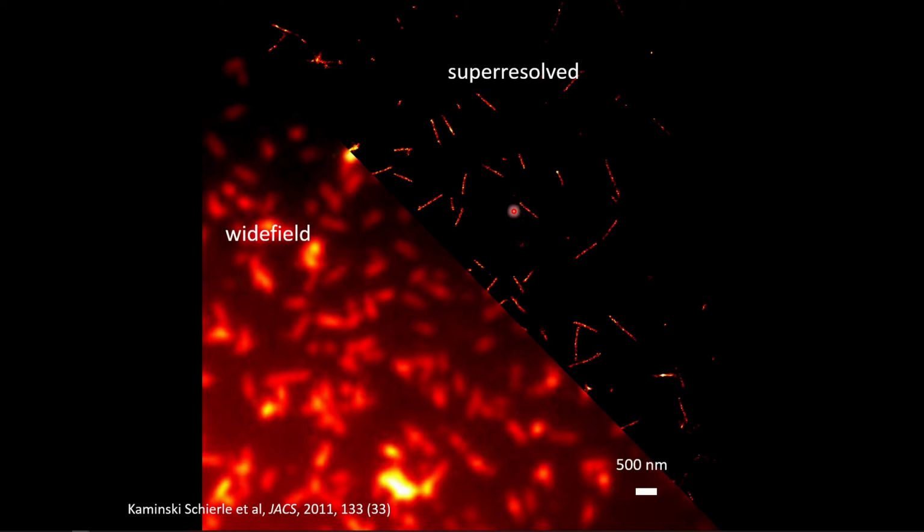What you see here is an image with a high numerical aperture lens, a fluorescence image of a protein called A-beta, and this protein forms fibrils in the brains of patients who suffer from Alzheimer's disease. These fibrils then clump and displace and kill brain cells, and this is of course what leads to dementia.